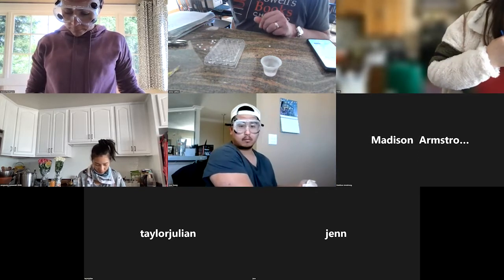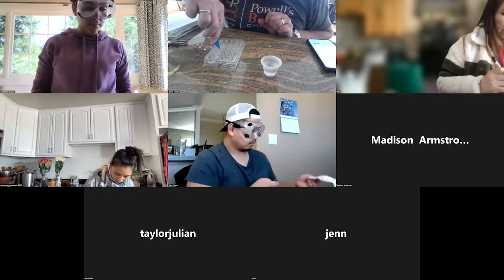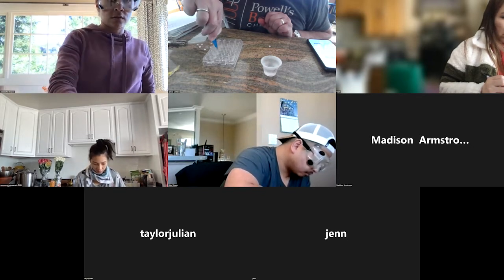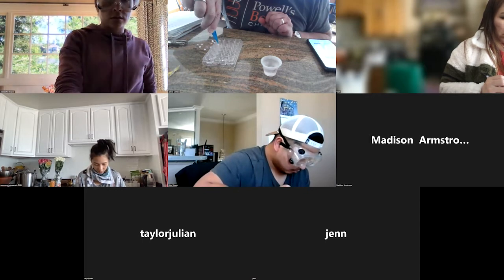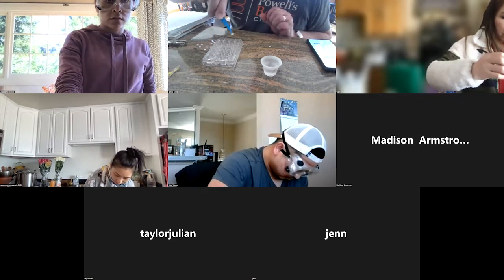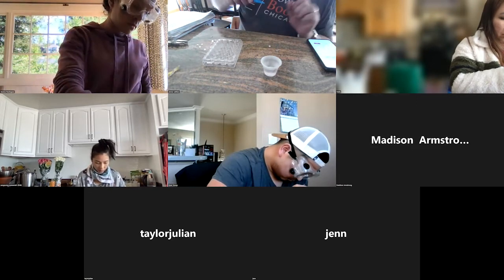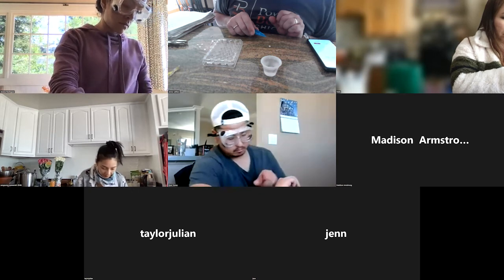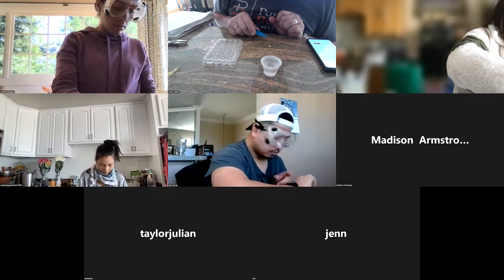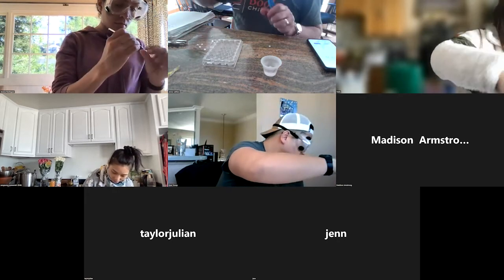So I'm doing these 4 times and then throwing out the one that looks odd. Two.